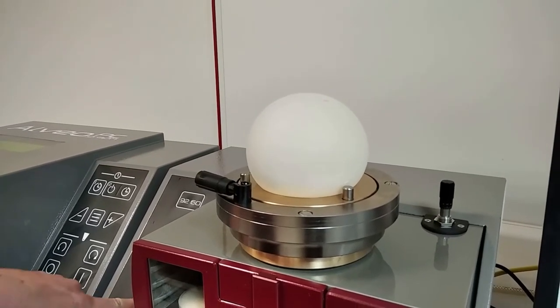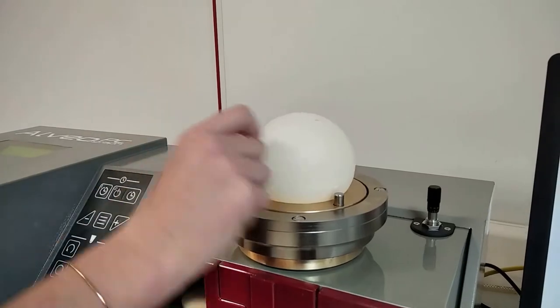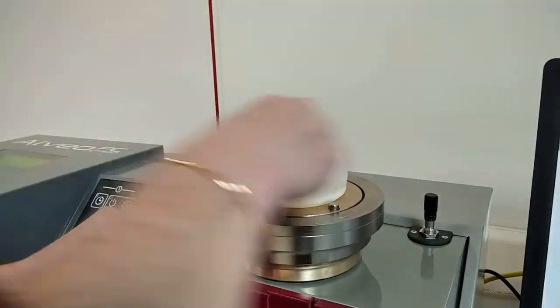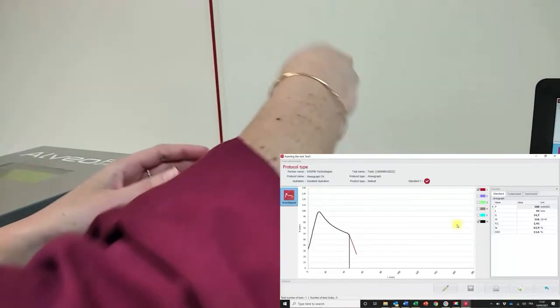As soon as the bubble breaks, stop the air supply, loosen the upper plate and remove the dough. The curve appears on the screen.